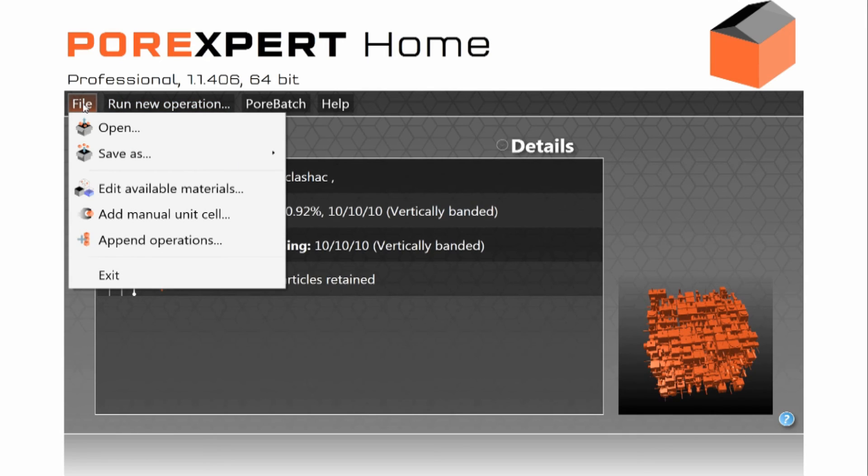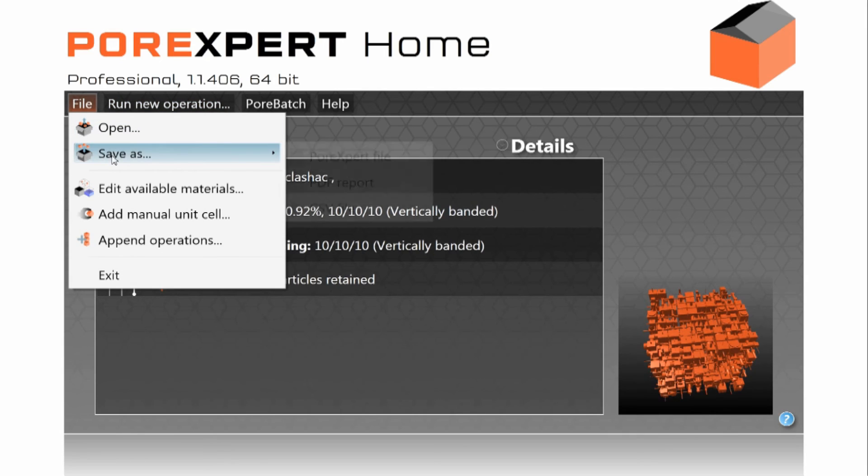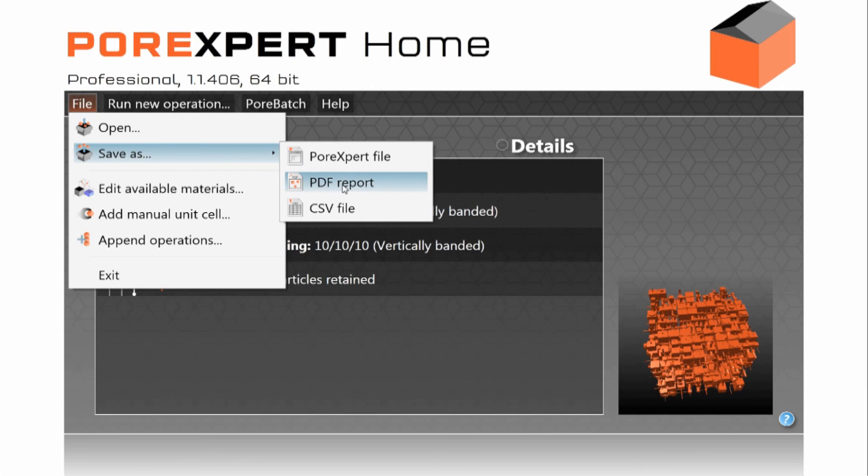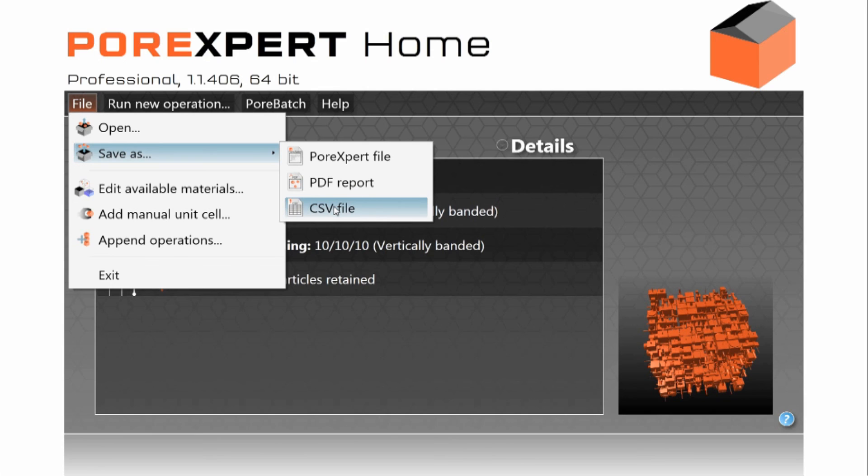Finally once you've finished you can save as a PoreXpert file which allows you to restart exactly from where you have left off. You can save it as a fully formatted PDF report for example for your line manager or in quality control applications. You can save it as a CSV file which will output into spreadsheets such as Excel or into graphical packages such as SigmaPlot.